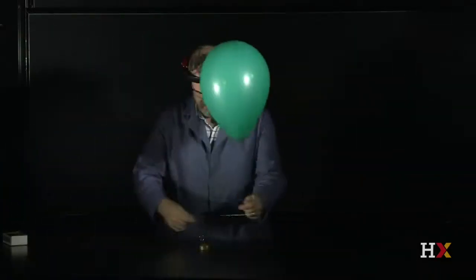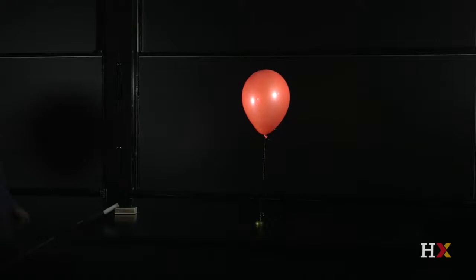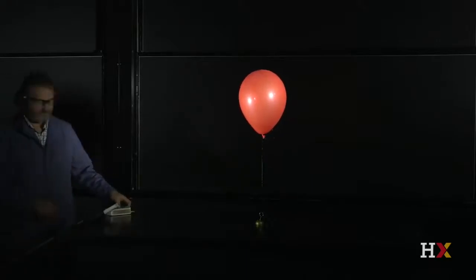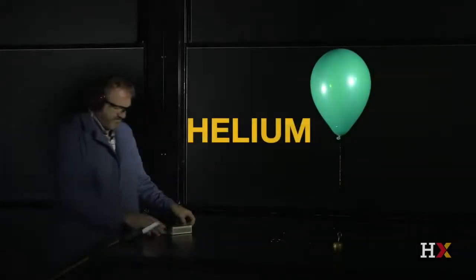As you may have guessed, the 3 balloons each contain different gases: helium, hydrogen, or a mix of hydrogen and oxygen. Let's take a look at the 3 different balloons and see what happens to each one. We'll start with the balloon filled with helium gas.